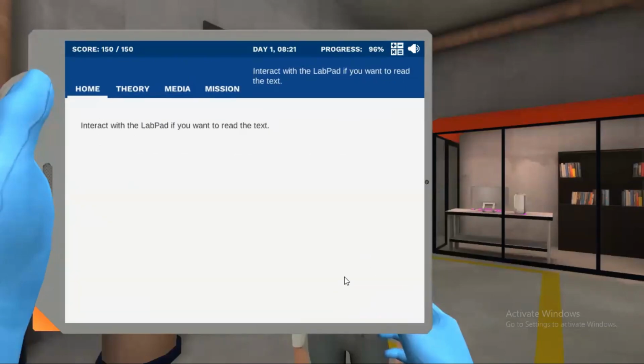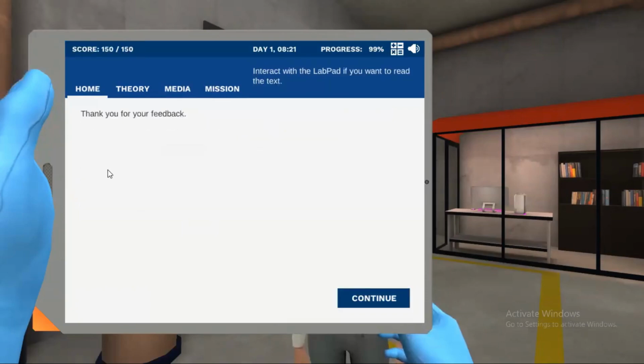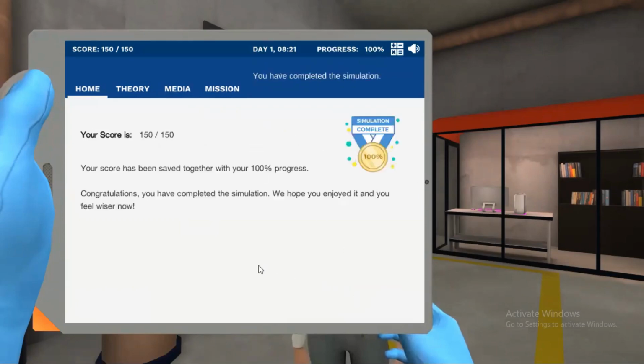Thank you. Let me ask you one last question. Do you feel like you gained relevant knowledge during this simulation? Thank you for your feedback. Your score has been saved together with your 100% progress. Congratulations, you have completed the simulation. We hope you enjoyed it and you feel wiser now.